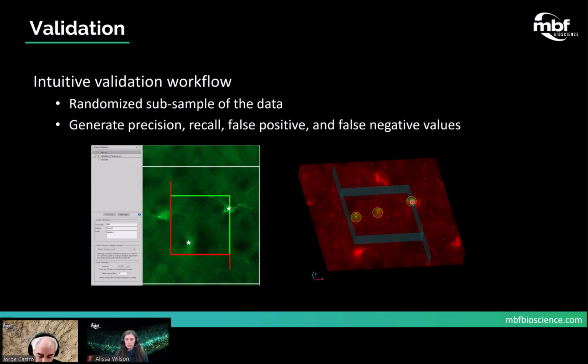In this particular case, the software was detecting the centroid really at the border of the sector. You can always use this view to rotate, and especially for determining the Z, if a marker is properly placed depending on the Z location, this view can be really, really helpful. And it's something that we didn't have in Stereo Investigator.